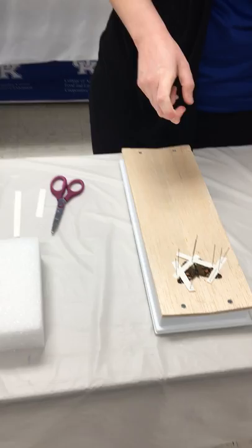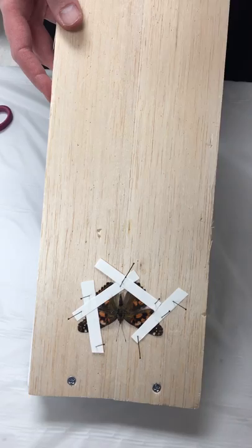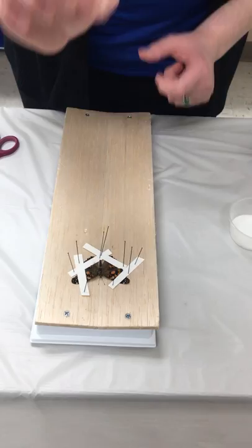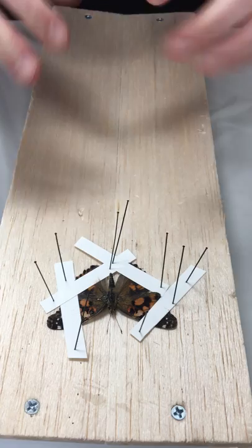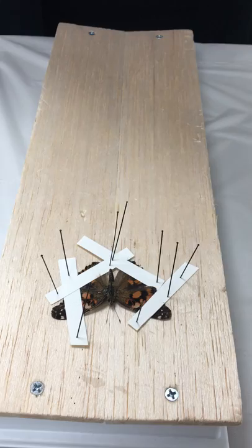If you have a butterfly or moth like this painted lady butterfly, you'll want to use a spread board. Bug club members can check out spread boards from the extension office, or make your own by cutting styrofoam into the right shape. You'll pin your butterfly or moth through the center of the thorax, stick it into the board, and use pins and strips of paper to spread the wings out as if it had just landed on a flower. You want the bottom edge of the forewing to touch the front edge of the hindwing so they look neat and lifelike.